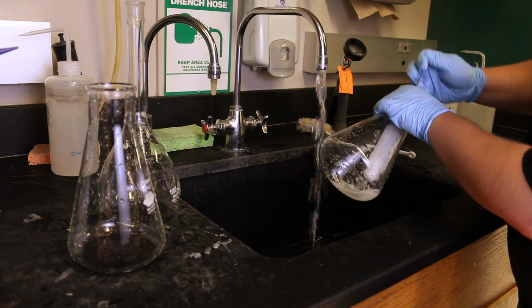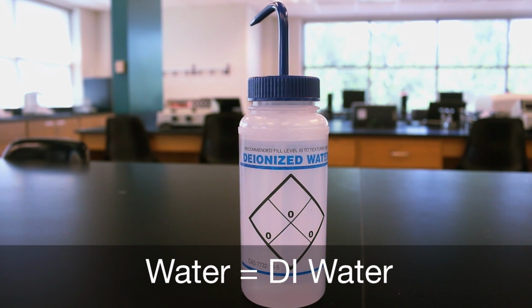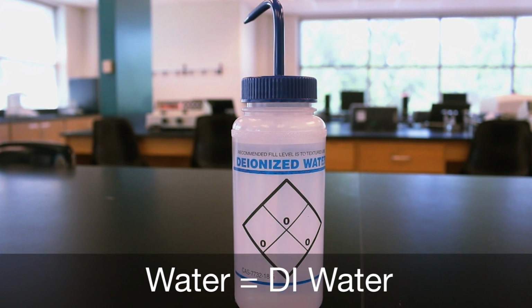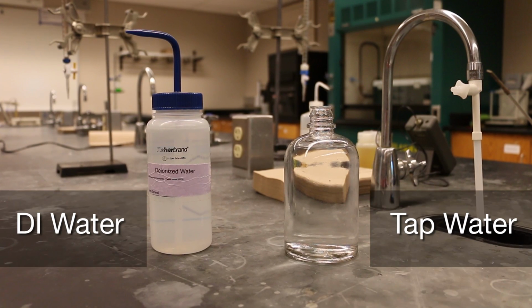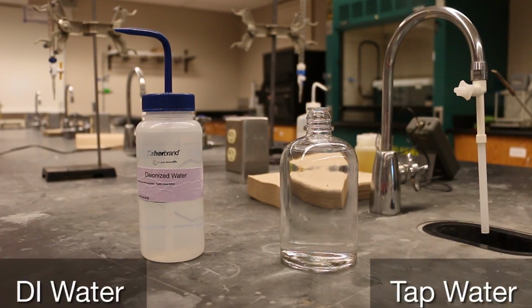One more note about deionized water. Every time your lab manual refers to water in an experiment, it means deionized water. Tap water has chemicals that often interfere with experiments. In DI water, they are removed, so using DI water will give you better and expected results in your experiments.